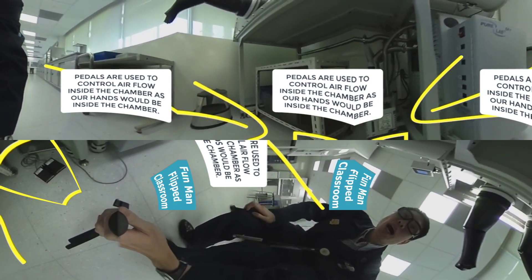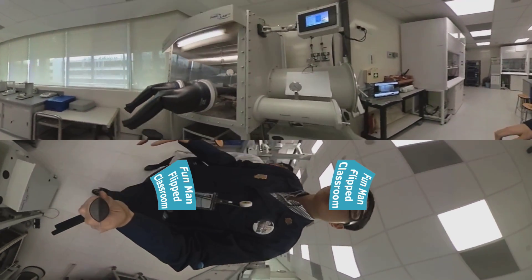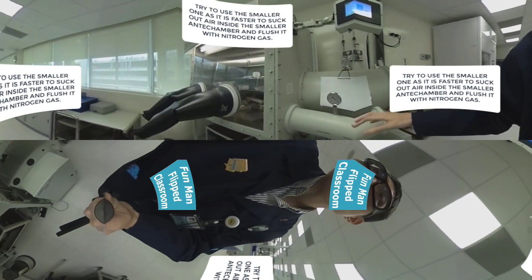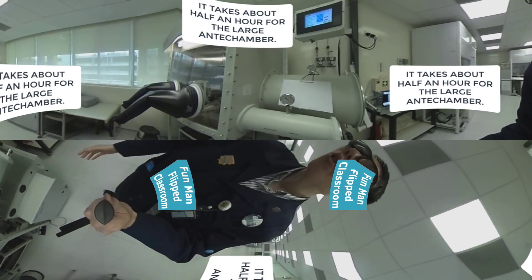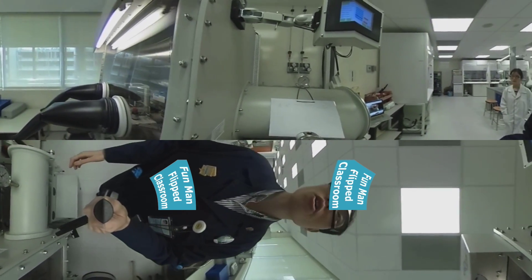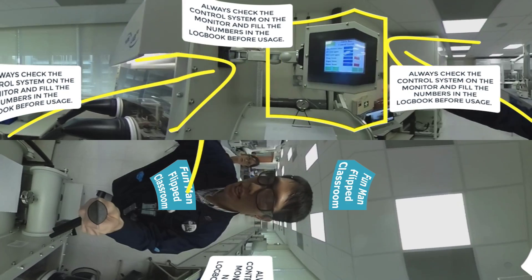See the paddles below — our hands won't be free later because our hands will be inside there, so you need to use your leg to paddle. Here we see two anti-chambers, the large one and small one. Try to use the smaller one because it's easier to evacuate all the gases and flush with N2 gas. The big one takes about half an hour. That's a logbook.